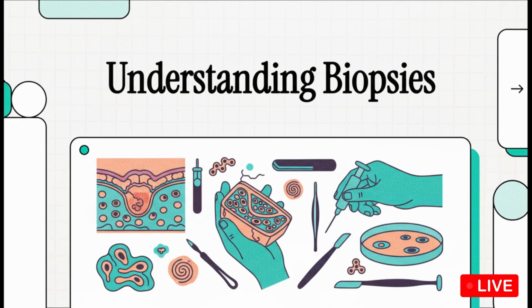All right, if you're a student, especially one following FZ-LabTech, you already know that the biopsy is pretty much the cornerstone of histopathology. But let's be real, with so many different types, from needles to scalpels to scopes, it can get confusing fast. So in this explainer, we're going to break it all down for you and make it crystal clear.